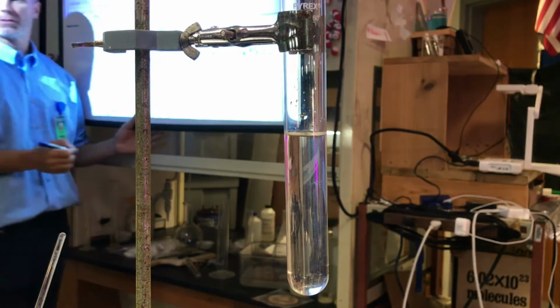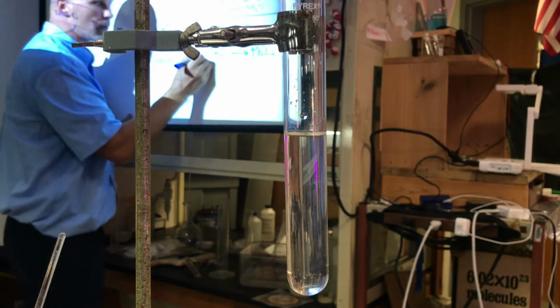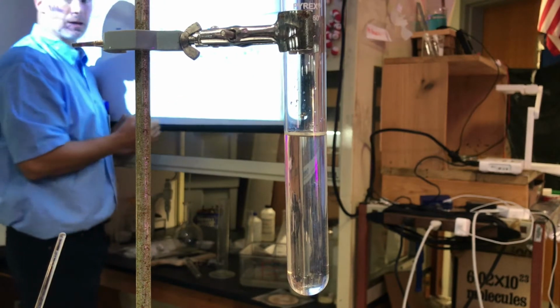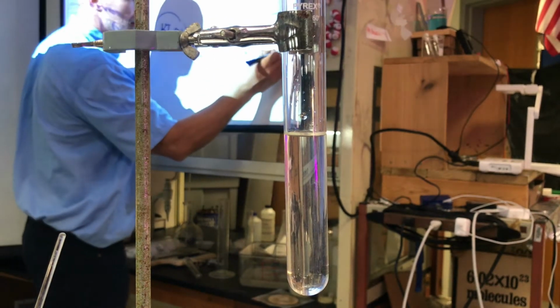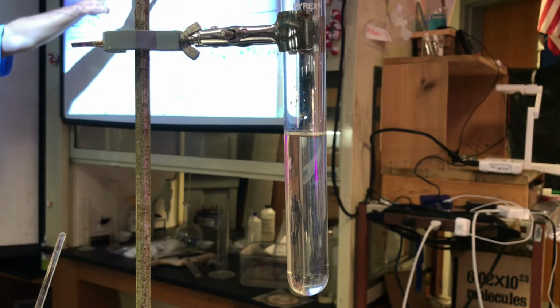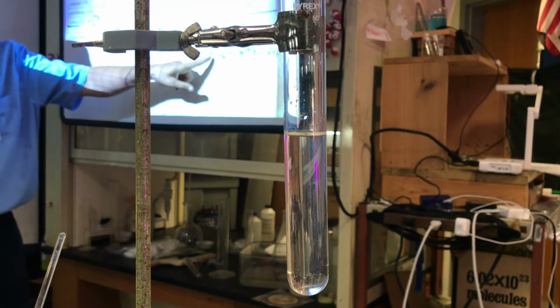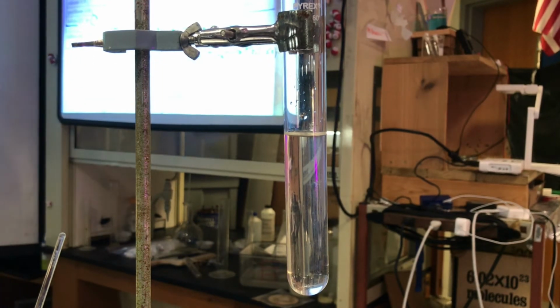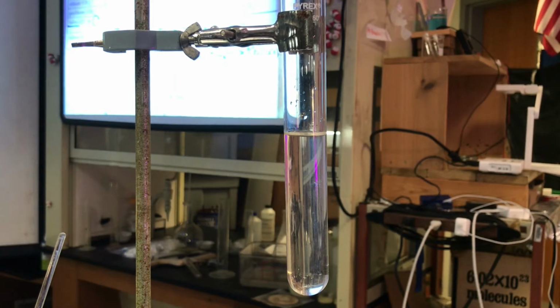And what would be the phase? These are aqueous, these are free because water competed with those charges. What's this going to make? Solid. I'm going to make a precipitate. If a precipitate is forming, what's happening to the amount of lead ions and iodide ions in solution? What's happening to the number of free ions? Decreasing. You're taking out the free ions, right? They're coming together to form a crystal.